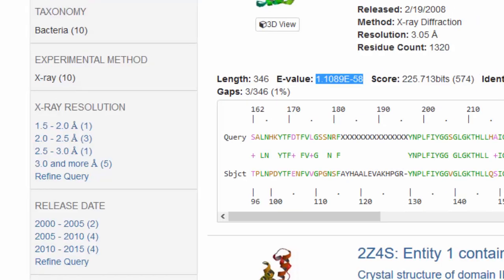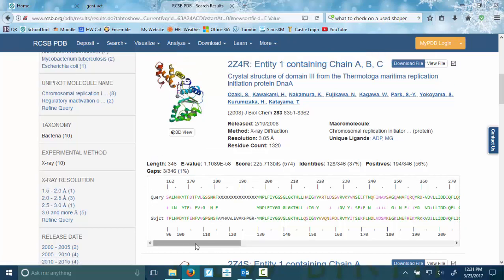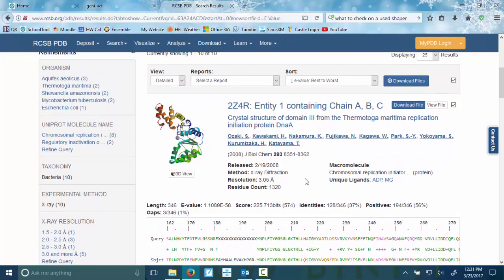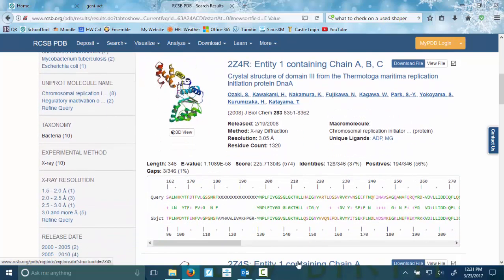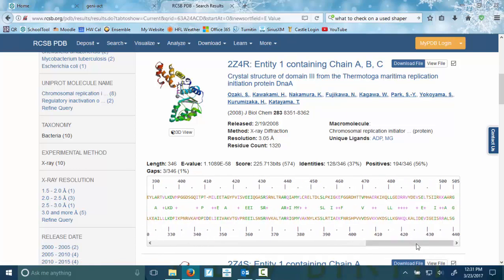And the pairwise alignment, we are going to try to get this whole thing. But getting this into the notebook, I mean, this is not going to be very easy because you have to scroll. So there is an easier way built in that might be available for your protein. So if this isn't available, what you would do is you would start at the end of the alignment and do like I showed you in another one in a trick.